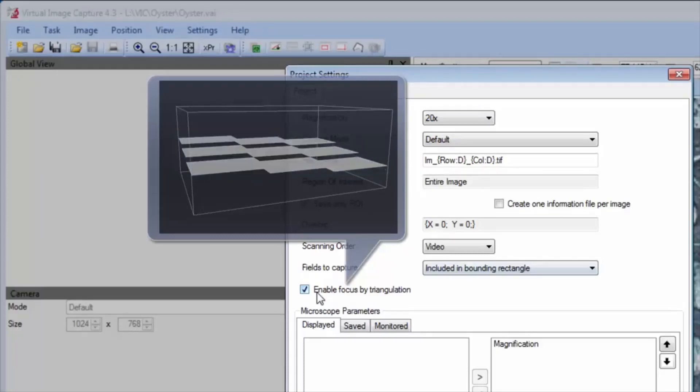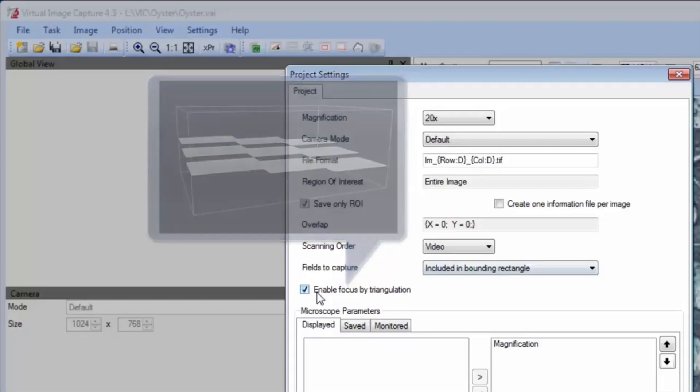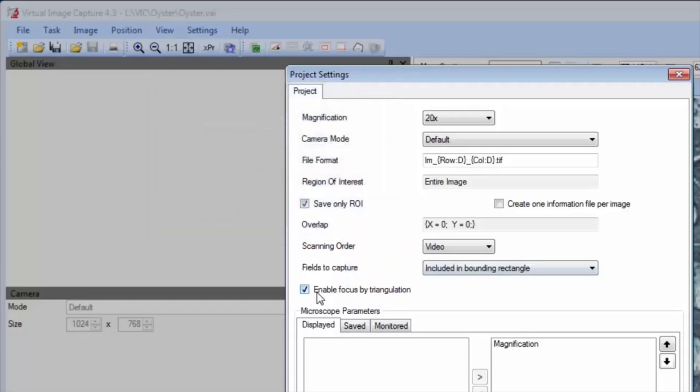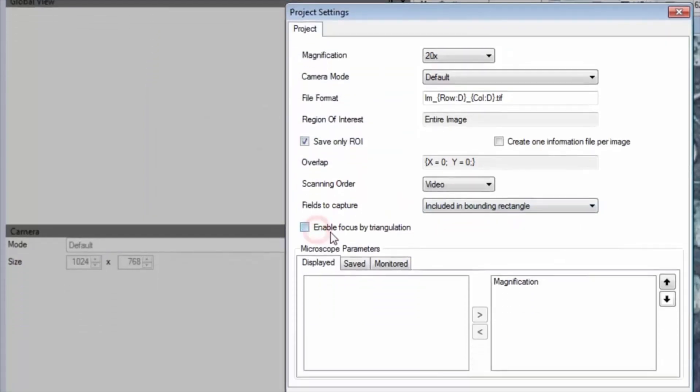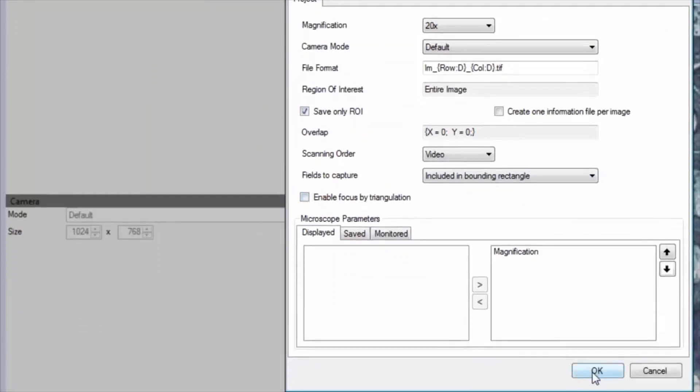In this video, the focus by triangulation is disabled. Properties of the hardware can be shown or hidden. The magnification option is set as displayed.